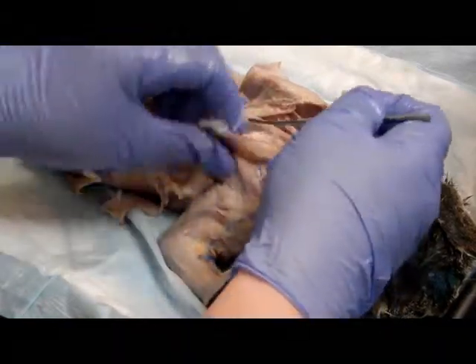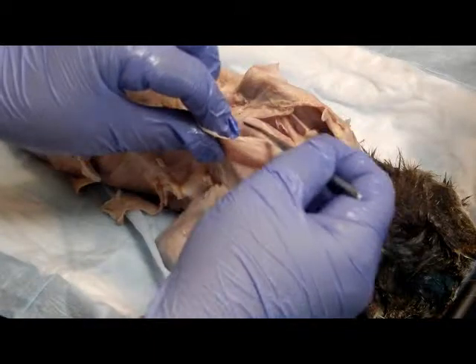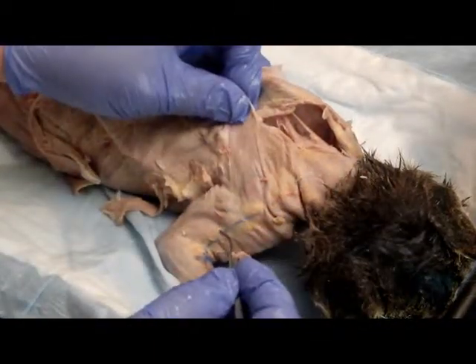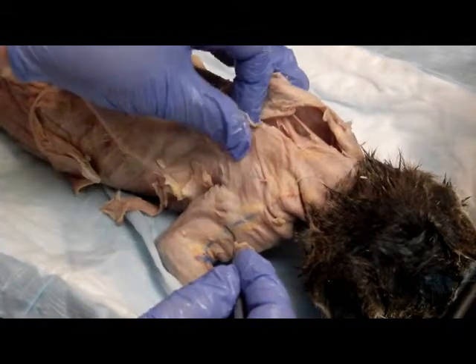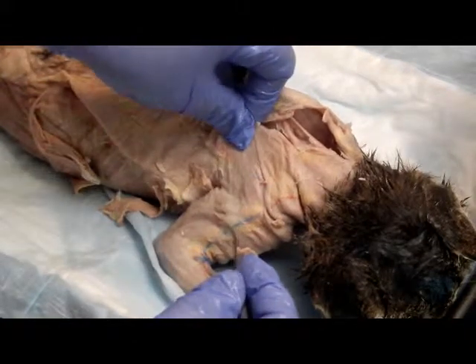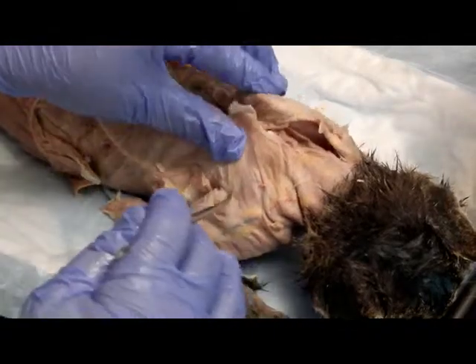The acromiotrapezius. Its origin is the neural spines of the cervical and first thoracic vertebrae. Its insertion is the metacromion process and spine of the scapula and fascia of the clavotrapezius. Its function is to draw the scapula dorsad, which is towards the back, and holds the 2 scapulas together.